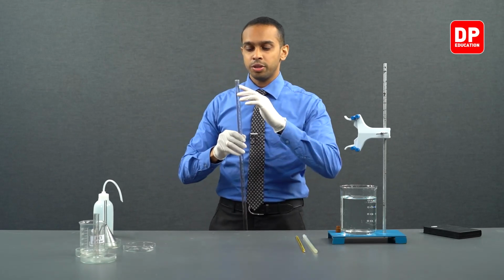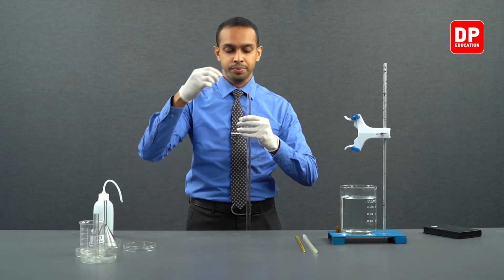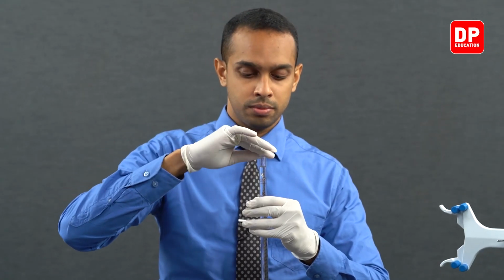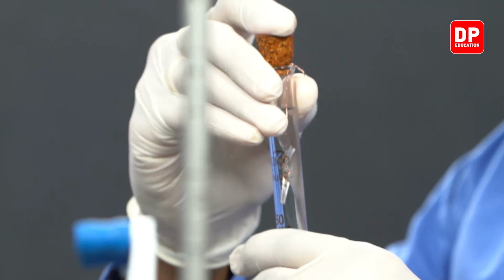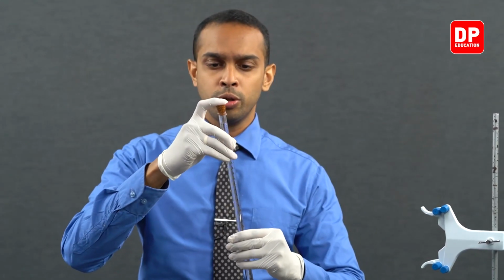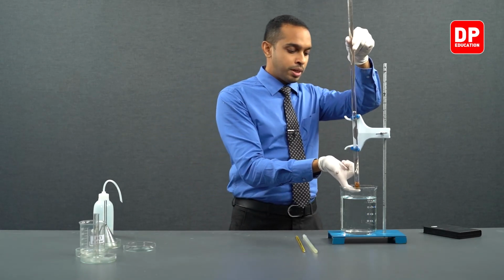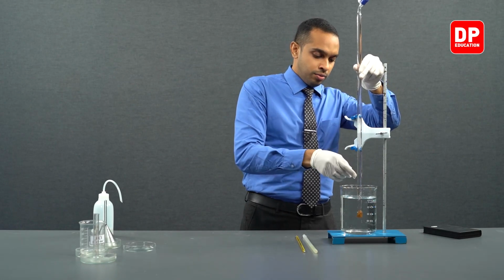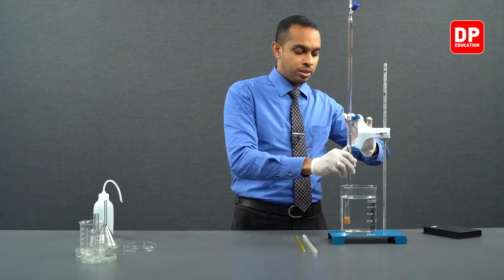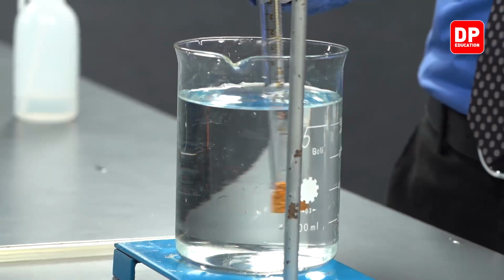After adding water all the way to the top, we can now include our magnesium strip. Then we'll place our cork and secure the magnesium strip in place, like this. Afterwards, we'll close the opening of this cork and turn the burette upside down, and we will place the burette inside water like this. I've used the retort stand to hold the burette in place.